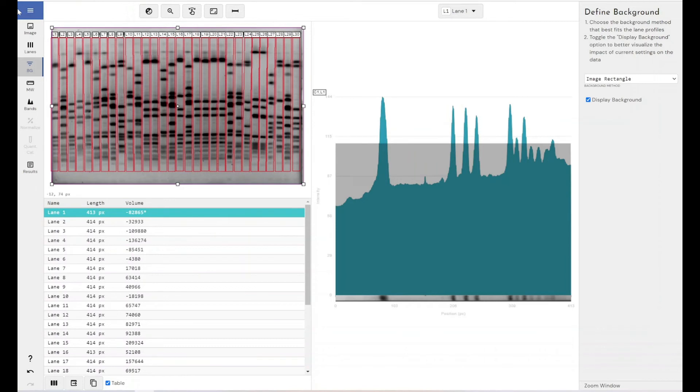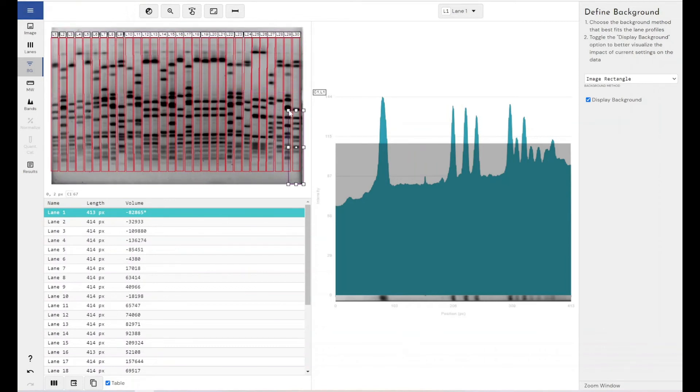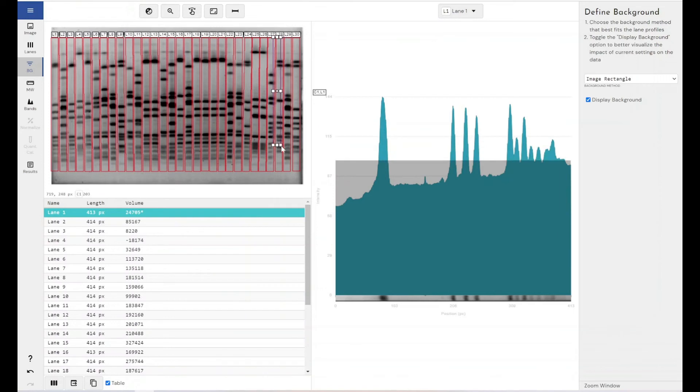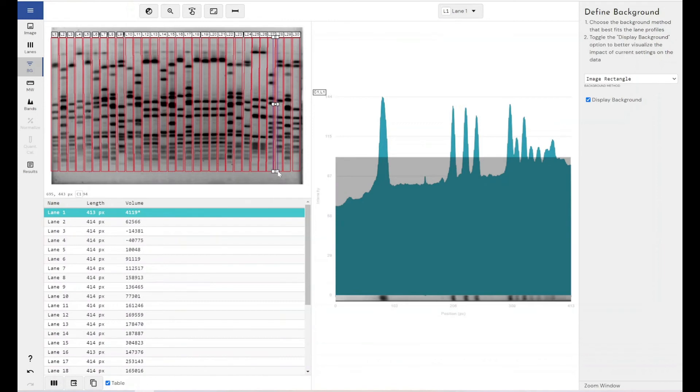And then we've got the ability to use an image rectangle. So when you click on image rectangle, you will be given a purple adjustable box here on your image. And you would size this purple box to how large you want your rectangle to be, and you would place it along the area that you want to represent your background.